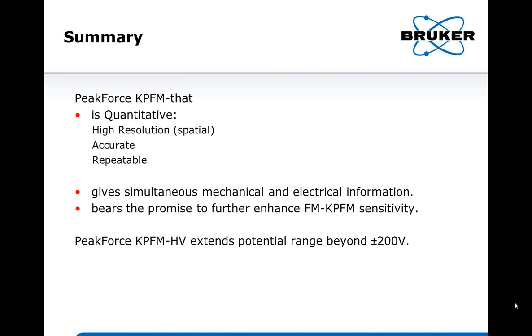Of course, if your sample is highly hydrophilic, it has some dependency on the sample, or if some samples can be easily oxidized, then in that case it's sample dependent. So we're really talking about the instrumental contribution, right? Right. We try to work on the instrumentation side to make it more repeatable.